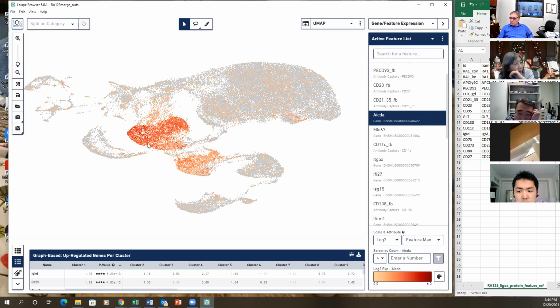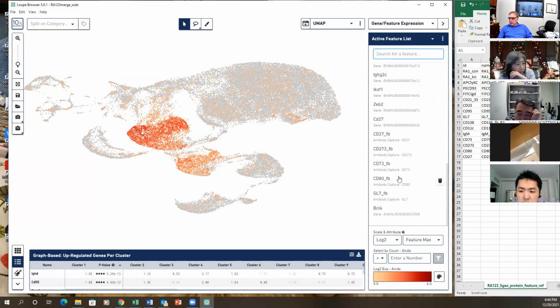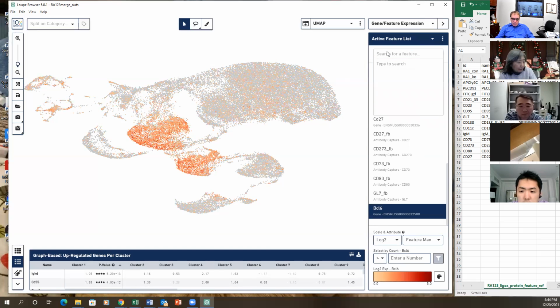Yeah, so germinal center is high. But this area is kind of like a small non-germinal center ASC area here. It is true, but they're not germinal center. No. And they don't have high AID either. A little bit, compared to, you know, a little bit, but that's not their feature. And it's not BCL6 positive. It is not germinal center, but it does have some feature to allow them to make antibody.